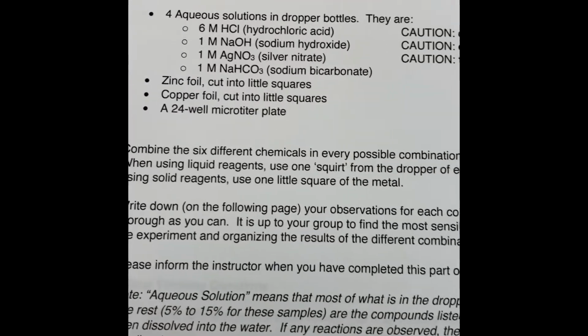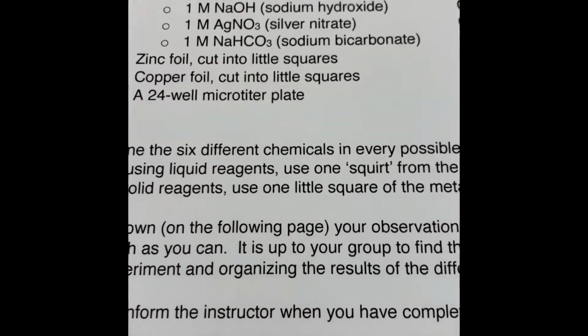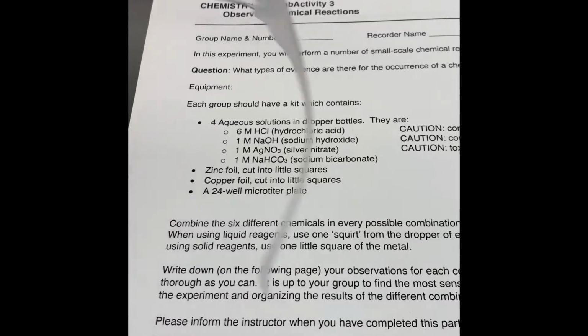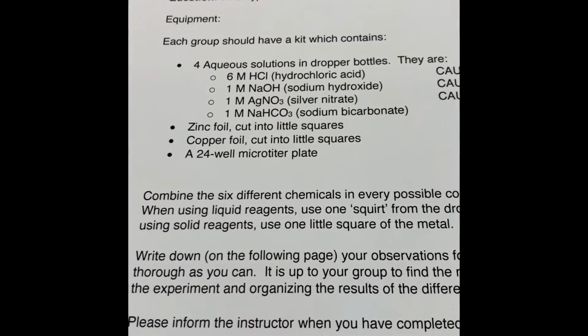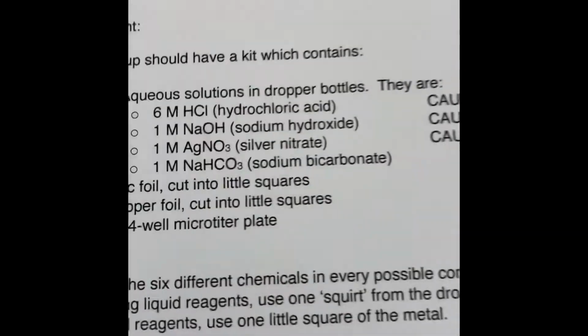Let's look at some of the reagents we'll be using today. I'm going to need my trusty safety glasses. So let's look in our kit.